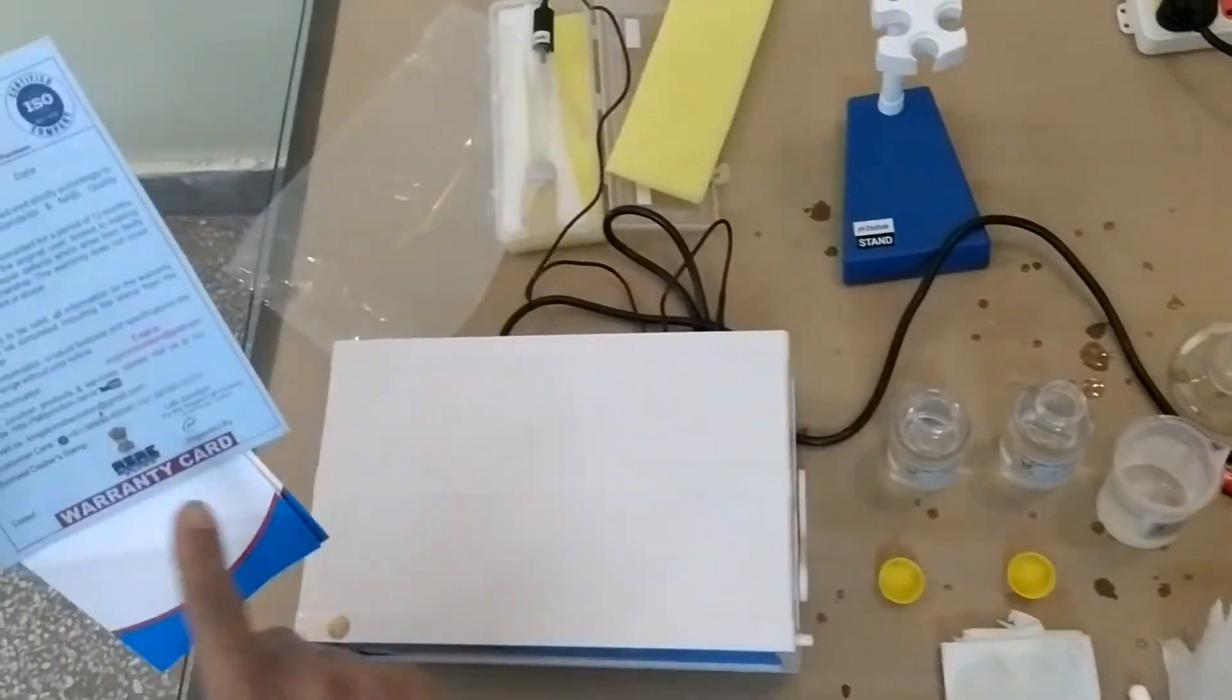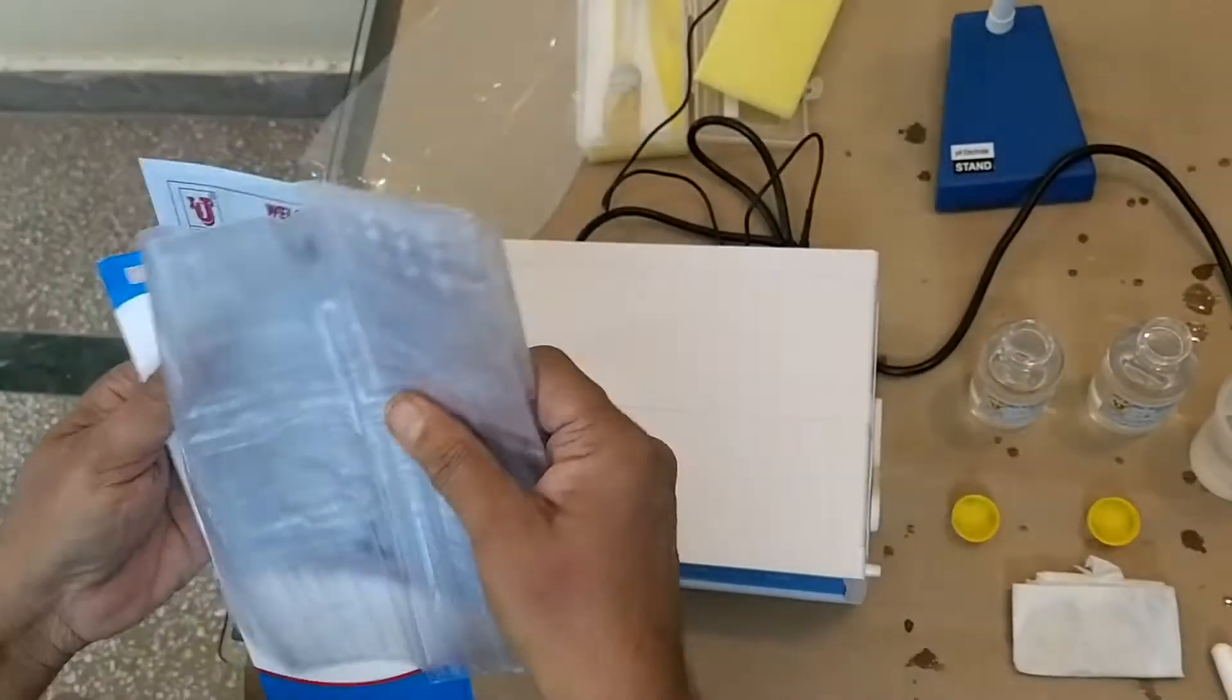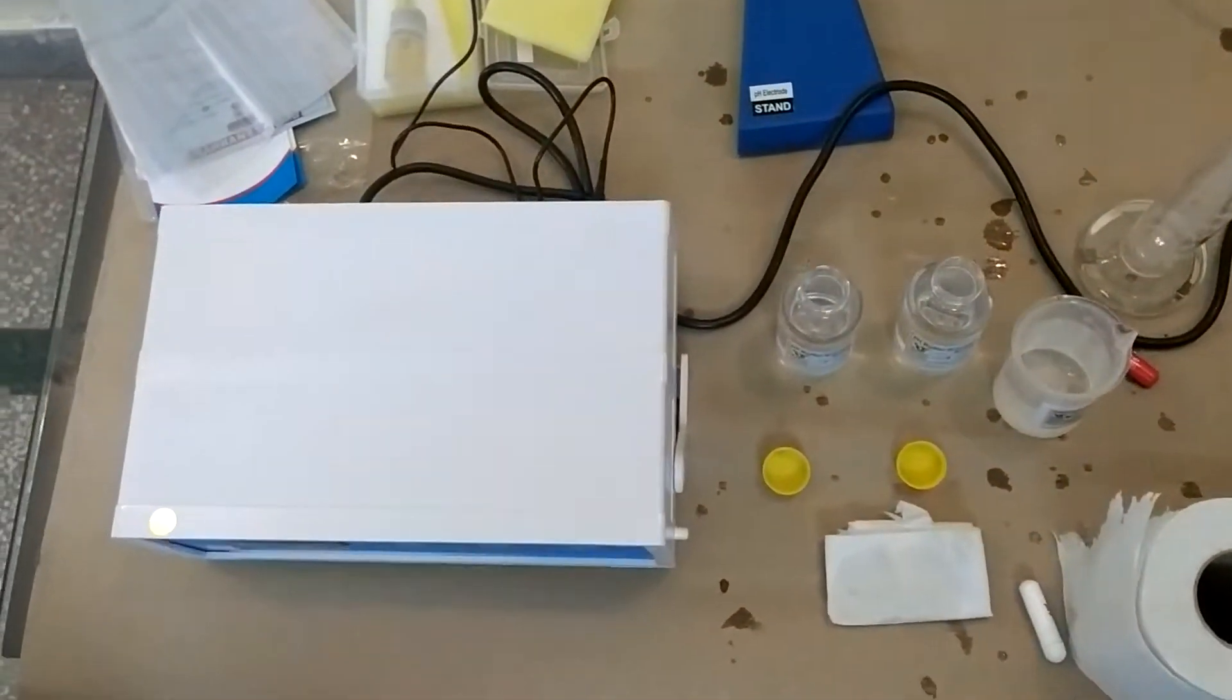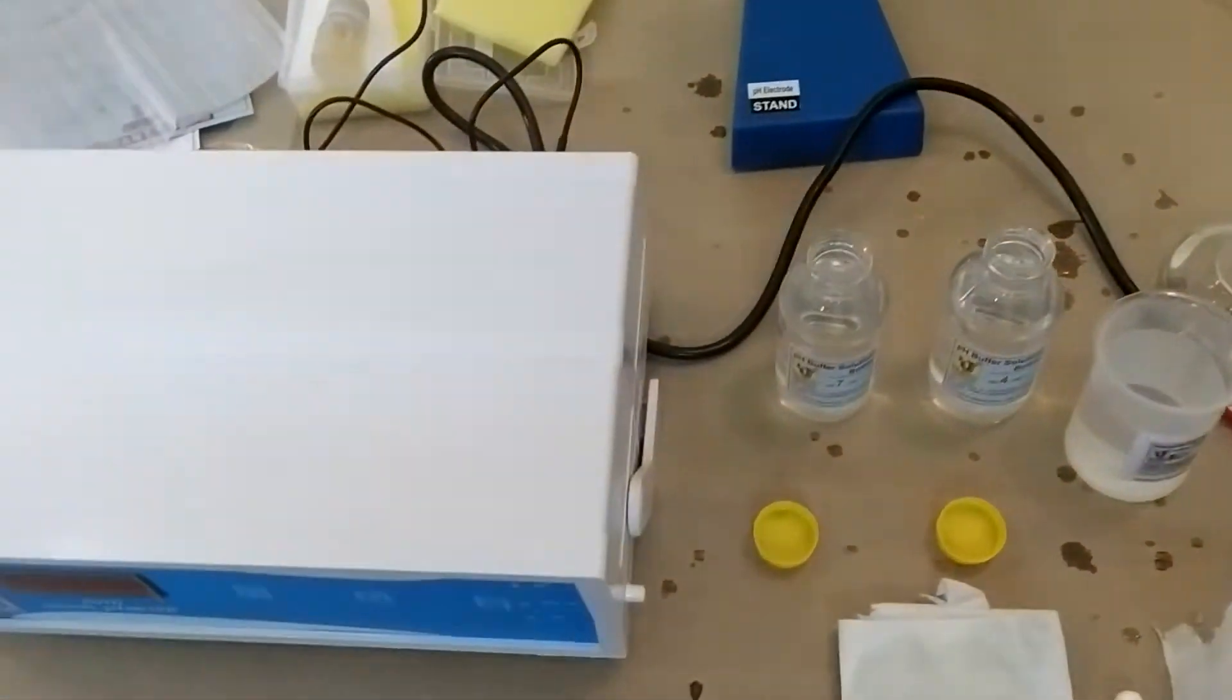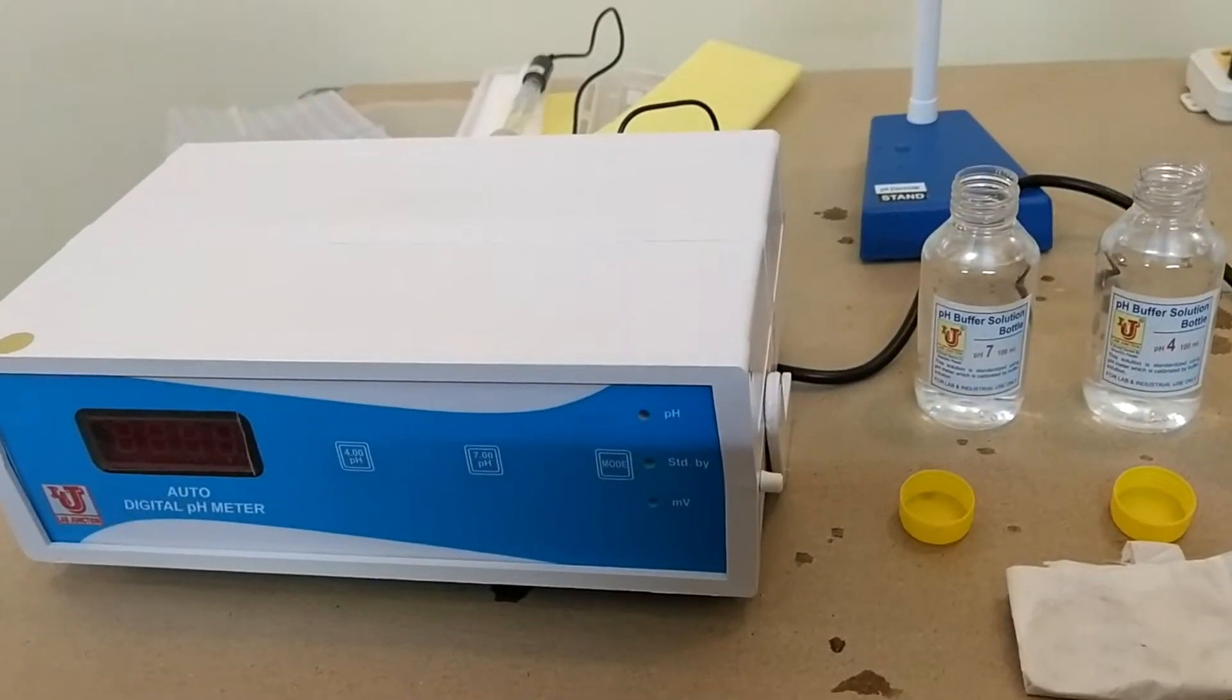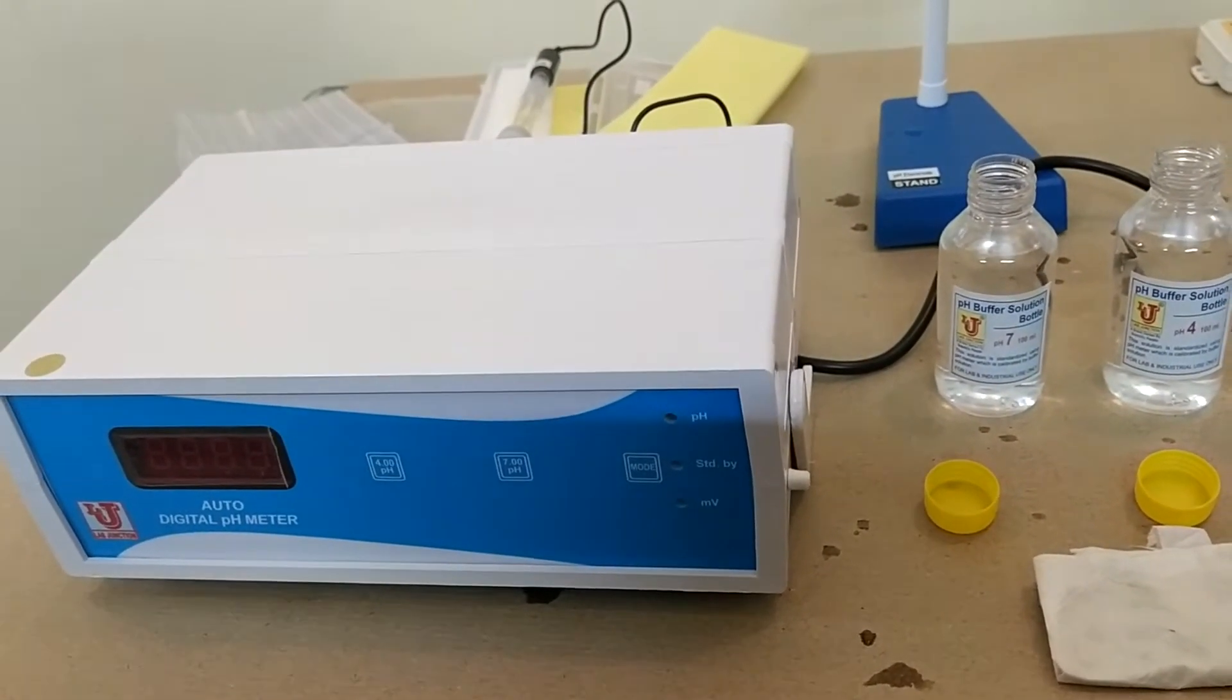This is the warranty card for 1 year. Now, how to calibrate Lab Junction Auto Digital pH meter.